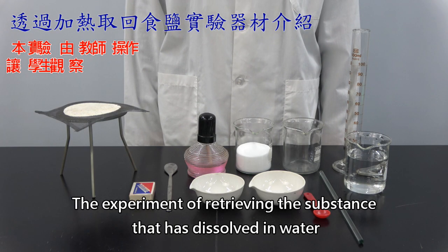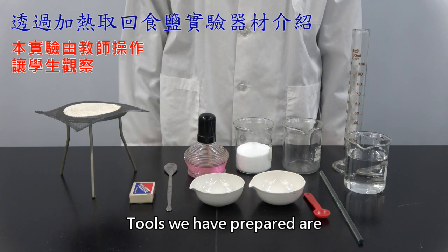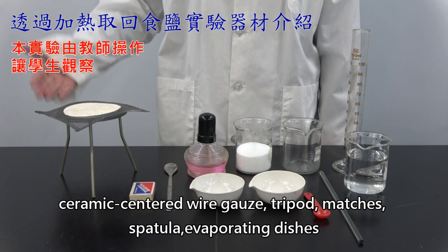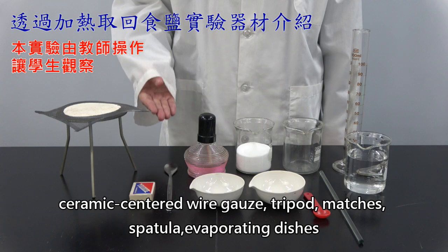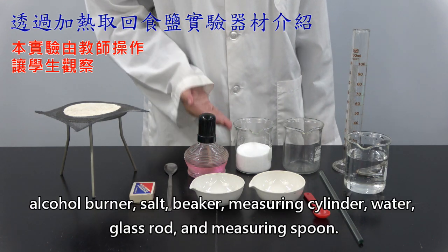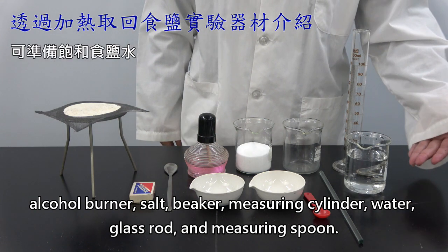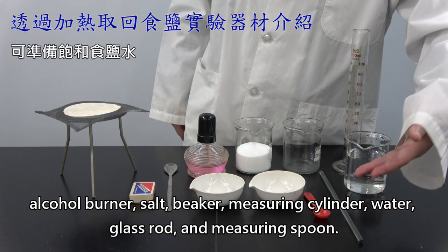The experiment of retrieving the substance that has dissolved in water. The tools we have prepared are: ceramic-centered wire gauze, tripod, matches, spatula, evaporating dishes, alcohol burner, salt, beaker, measuring cylinder, water, glass rod, and measuring spoon.